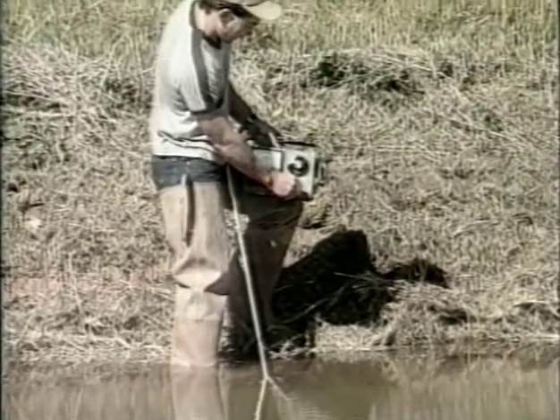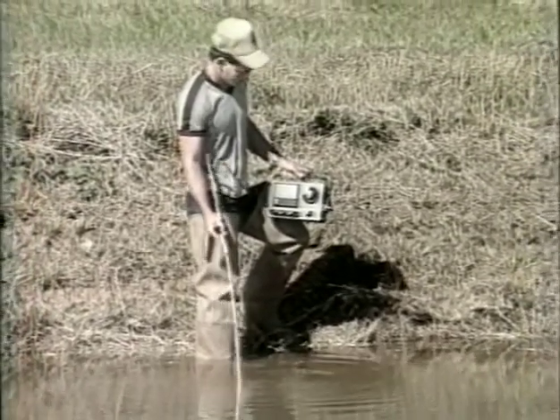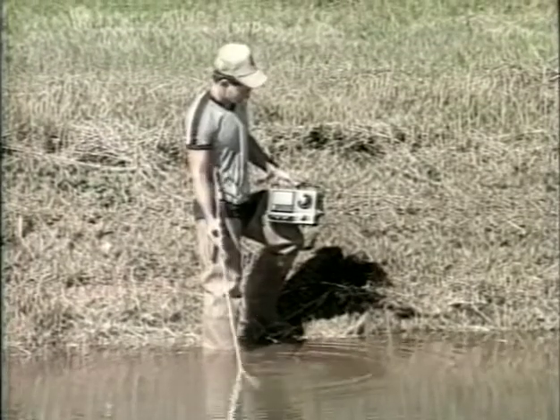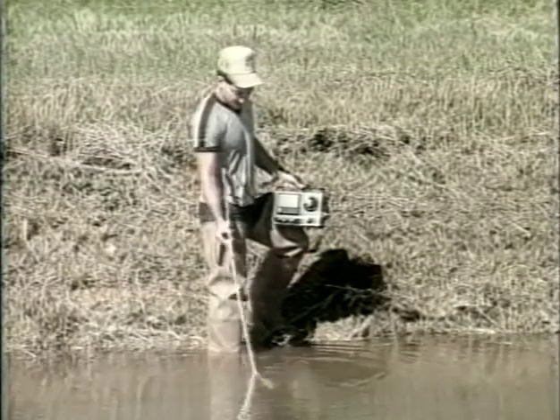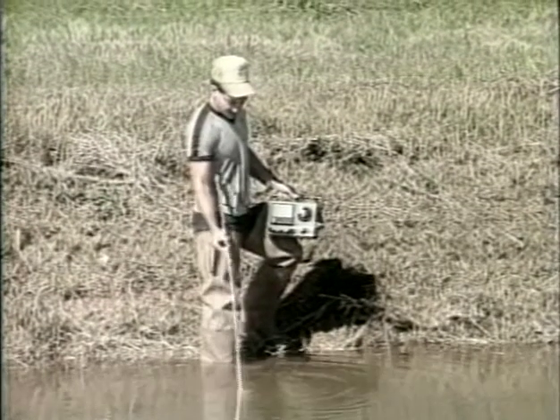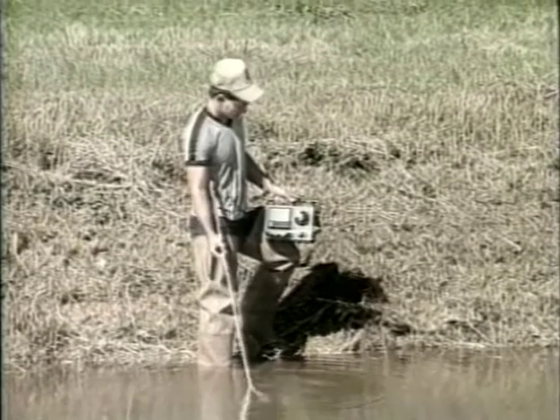Once the calibration reading or the altitude reading is stable, switch the meter to the temperature position. The temperature of the pond water is then taken by placing the probe in the water and moving it back and forth. It is desirable to take the temperature reading where the oxygen reading will be taken. Be sure the reading is taken away from the pond bank, incoming water, aerators, and if possible with the wind at your back. Submerge the probe about 1 foot below the surface. The probe may be attached to a rod or pole with tape, which will allow it to be extended into the pond and reduce the cable stress.